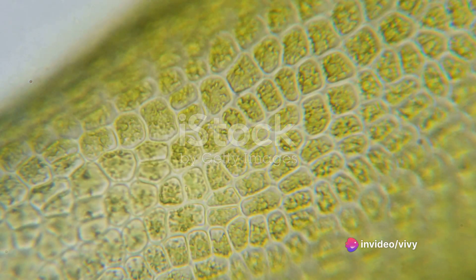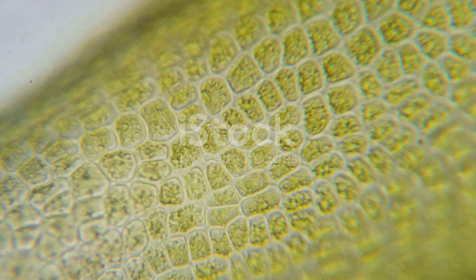Marvel at the cell wall, the nucleus, and if you're lucky, the chloroplasts, where photosynthesis happens.